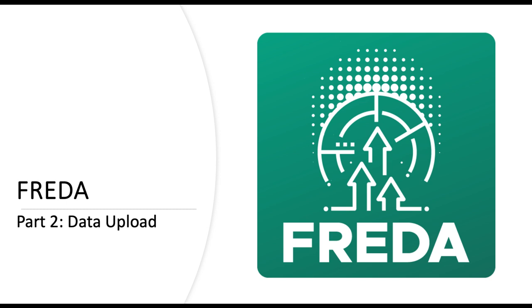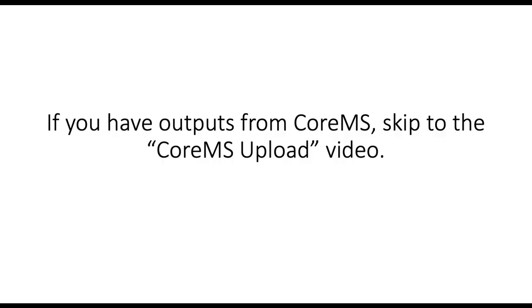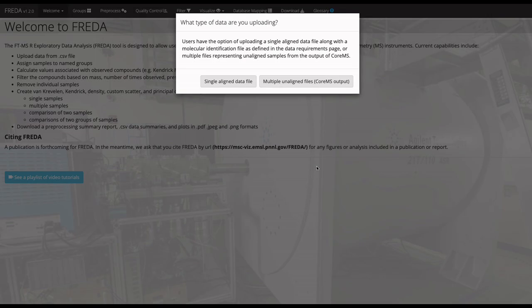Here we will cover how to upload your FTMS data to FREDA if you are not uploading data from CoreMS. If you are uploading data from CoreMS, skip this video and head to CoreMS Upload. When opening the FREDA application, you will be greeted by this screen.